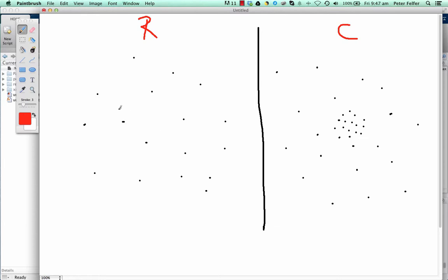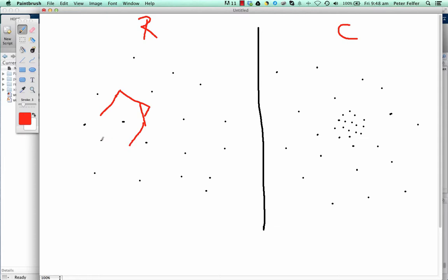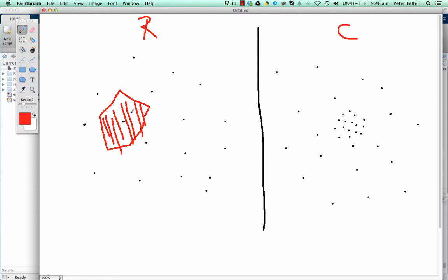Voronoi volume analysis means that you actually take the Voronoi cell of each of these dots. In our case, if it's atom probe data, this would be in 3D. The Voronoi cell is just the region around your point or your atom that's closer to that atom than to any other atom. This hatched area is the Voronoi cell of our atom. If you have something like a cluster, you have a different distribution of the cell sizes.